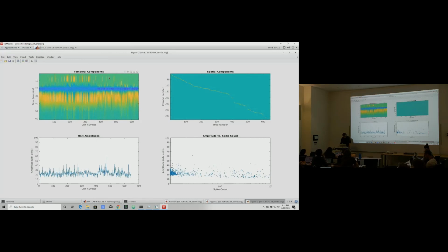And then you can see some patterns. For example, in this middle area, a lot of neurons have a more multiphasic waveform, perhaps, because there's this initial part up here, and then all of these other ones don't, like here and here. So it's aligned to sample 21 because that's how it's defined. That's by construction.